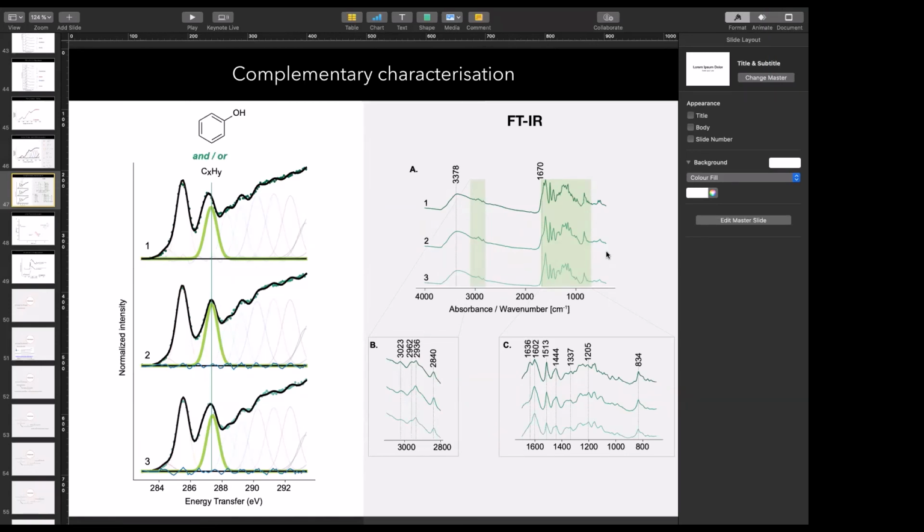Actually, I think Demosthenes has shown at SSRL they can even measure carbon. They measured oxygen and carbon Raman scattering from gas. You can measure very dilute samples as long as there is nothing else in there. That's the problem. The problem is that whatever absorbs X-rays will kill your scattering volume.